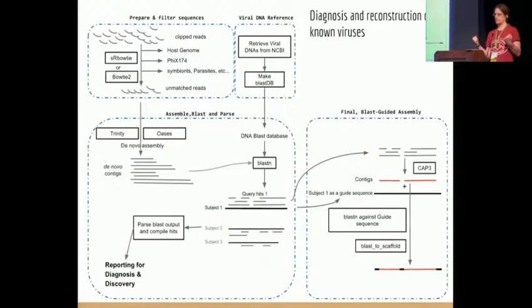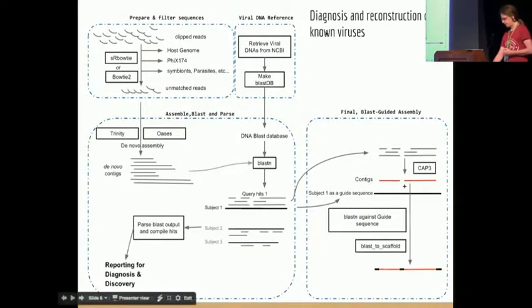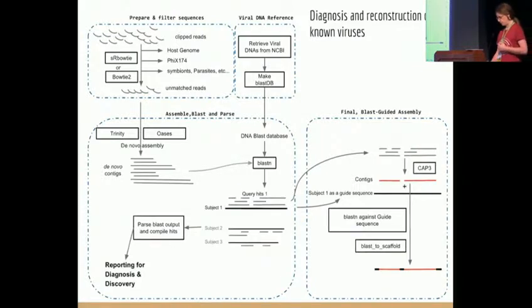They are quite often not complete. That depends on the characteristics of how the reads are derived from the virus, whether it's the genome or, in the case of small RNAs, they're very often degradation or cleavage products. And we can fill those in, for example, with Cap3. So we can rediscover the stuff that is already there.